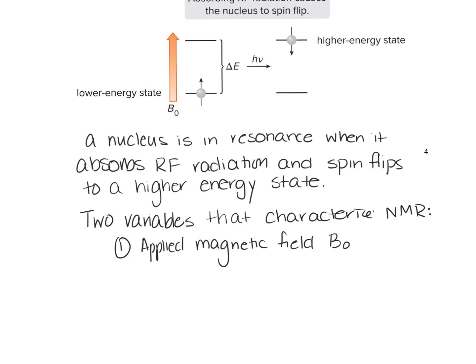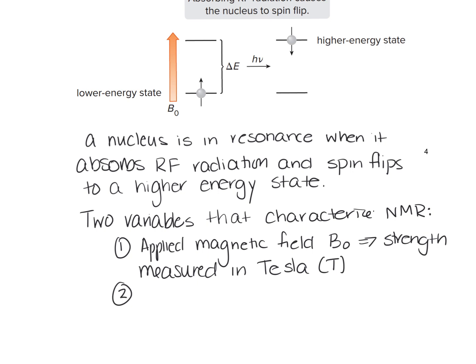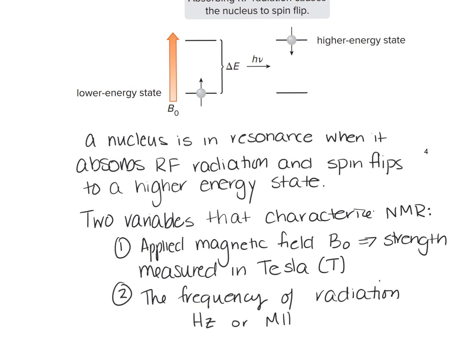Now that strength is measured in Tesla. And then the second is the frequency of radiation that's used for the resonance. Now, this is going to be measured in hertz, or you're going to see sometimes megahertz.